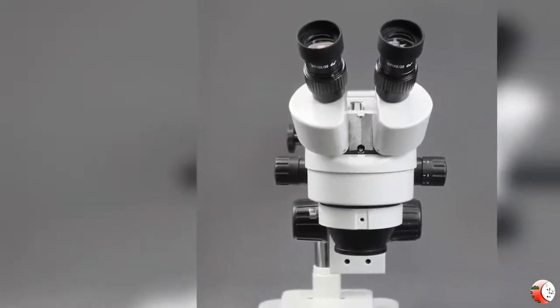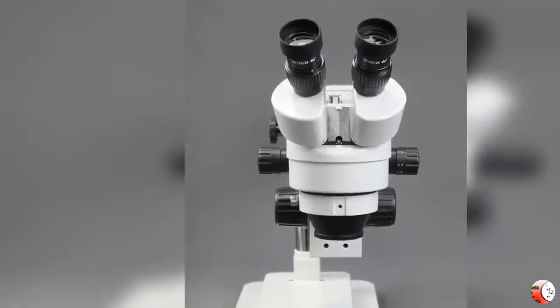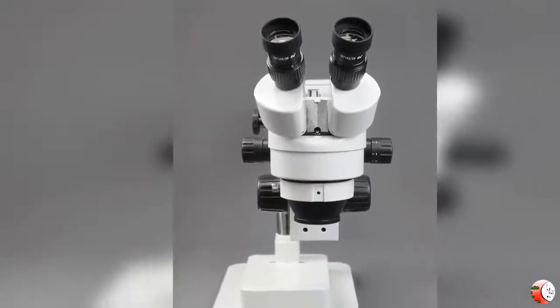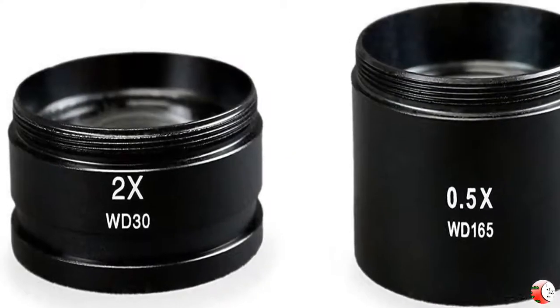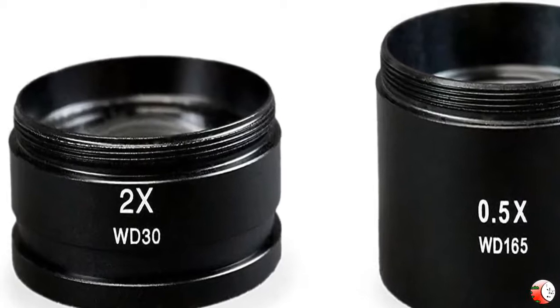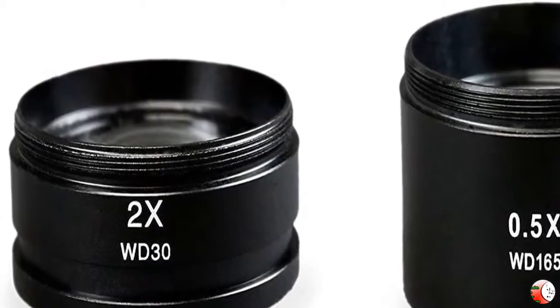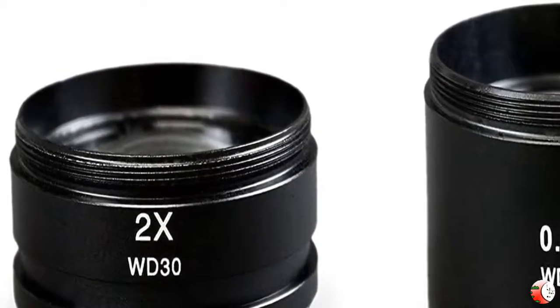Product Features: 1. 45-Degrees Incline Trinicular Head That Rotates 360 Degrees. The Simifocal Trinicular Port allows you to connect a digital camera or an HD touchscreen. It features a 54-76mm interpupillary adjustment.